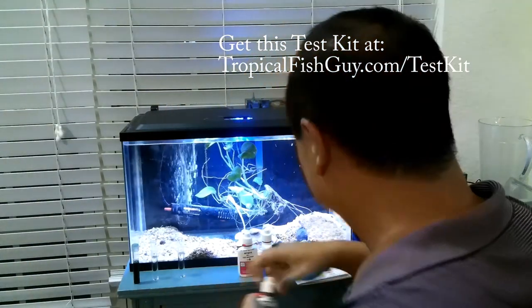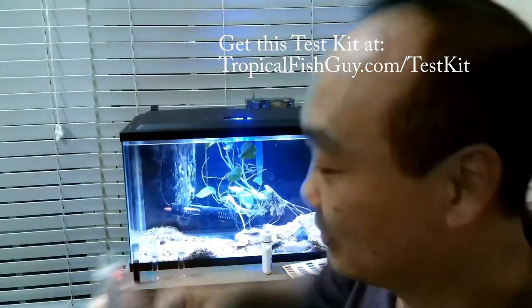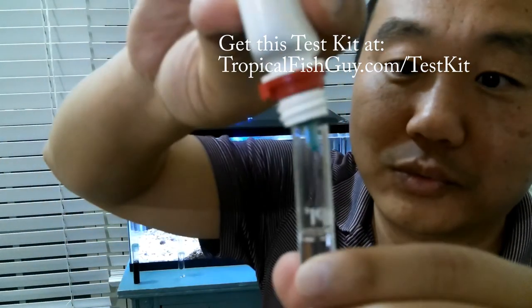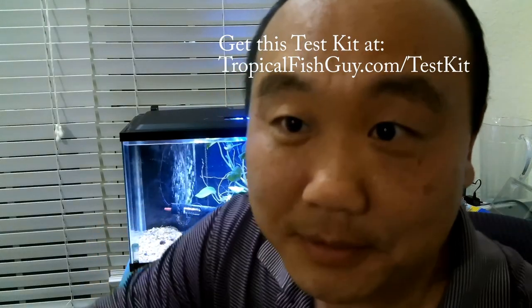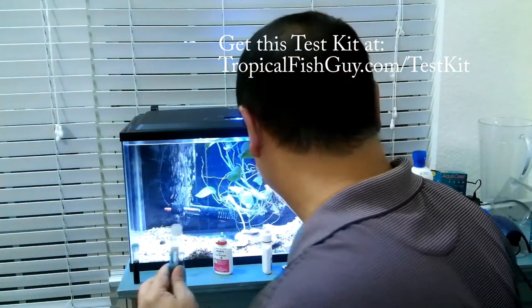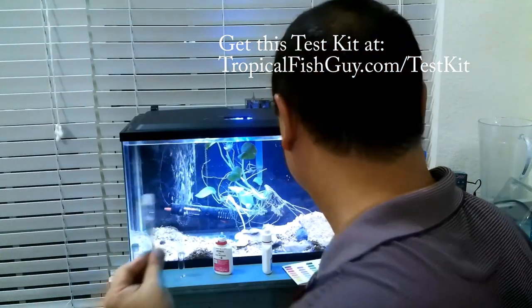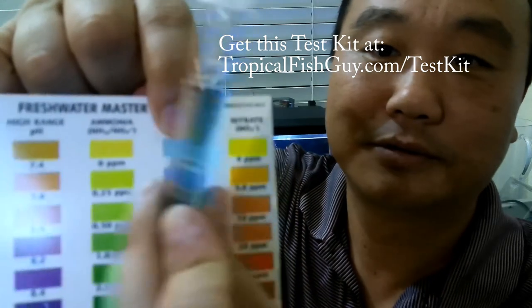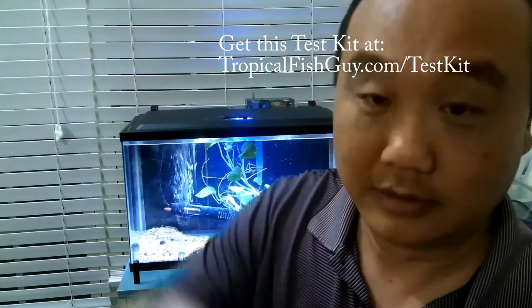That's why you test your water. Second test: nitrite, the second most deadly chemical. Same thing — hold down the red cap and turn it, five drops this time. Put the cap on, shake it up. Check your background — look at that, it's blue. That is good on the nitrite. Blue at zero parts per million — that's the color you want.